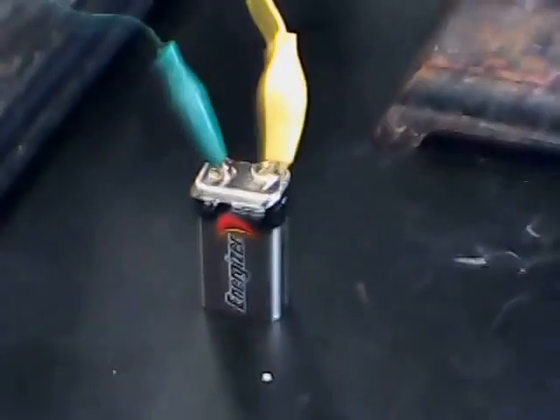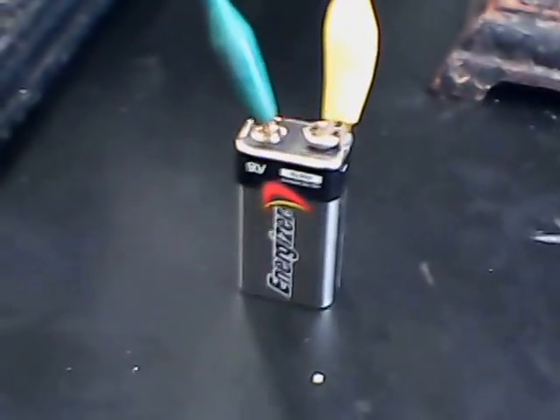The 9-volt batteries will be recharged with a solar panel. While this is running, I'm going to go grab one of those panels. Let's get a little bit of a close-up there. Let me grab one of those solar panels.